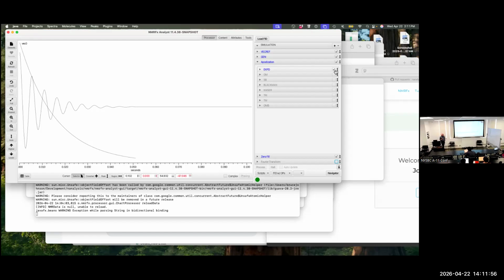With all these apodization functions, you're trading off various things. One, we want to get rid of those wiggles, and that's fundamentally important. We need to drive that signal to zero again. Otherwise there is this discontinuity in the signal. Basically, it's like convolving the signal with a square box, and the Fourier transform of that is going to give you these same wiggles.